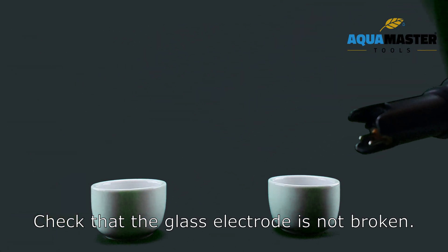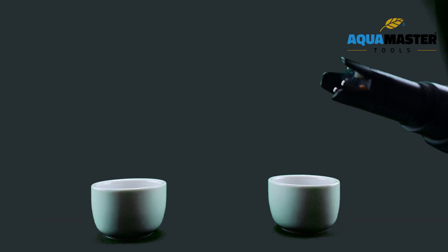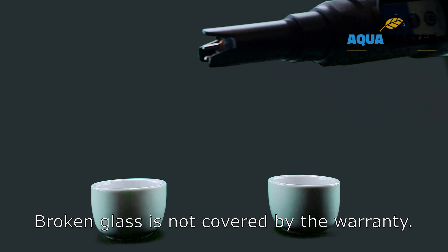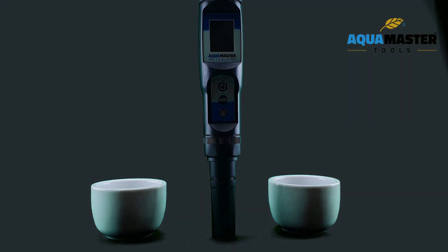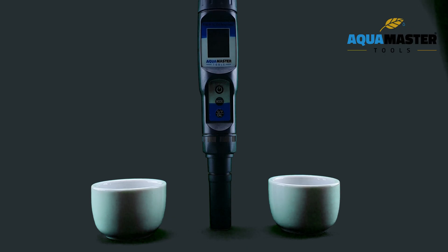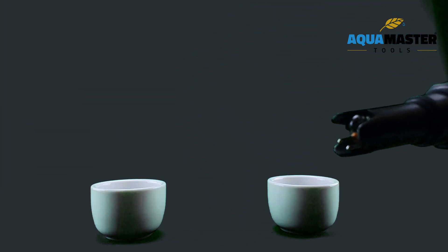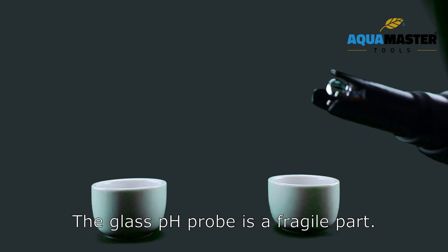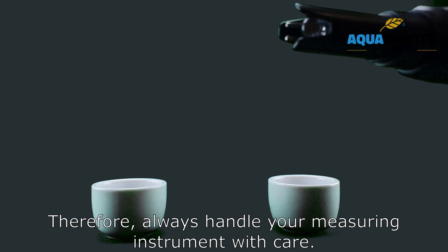Check that the glass electrode is not broken. Broken glass is not covered by the warranty. The glass PH probe is a fragile part, so always handle your measuring instrument with care.